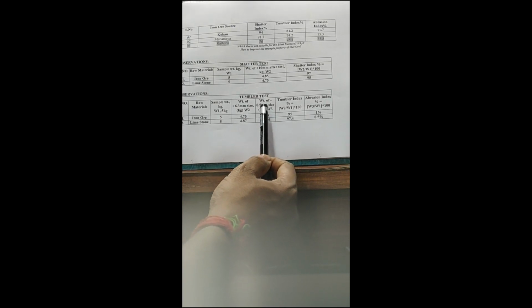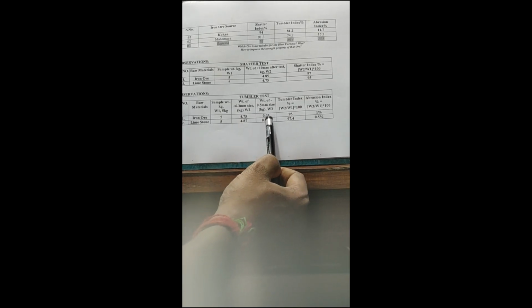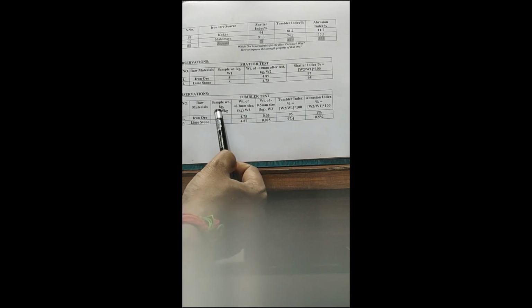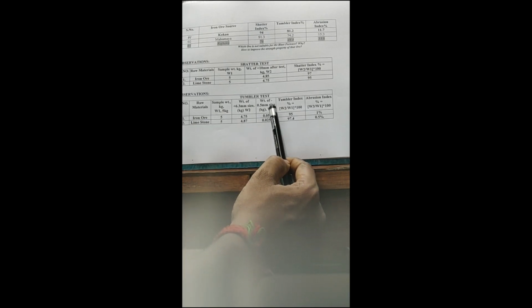The fraction of weight that passed through the 0.5 mm screen, meaning minus 0.5 mm, is 0.05 and 0.025. This will be W3. So W1 is the initial sample weight, W2 is the weight fraction of plus 6.3 mm size, and W3 is the weight of the minus 0.5 mm size in kg.